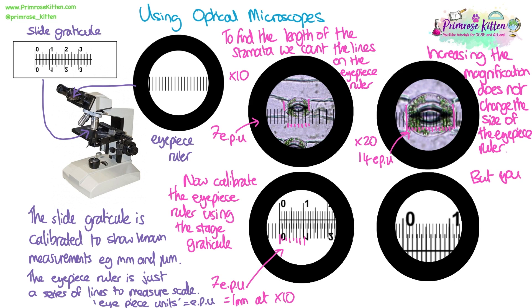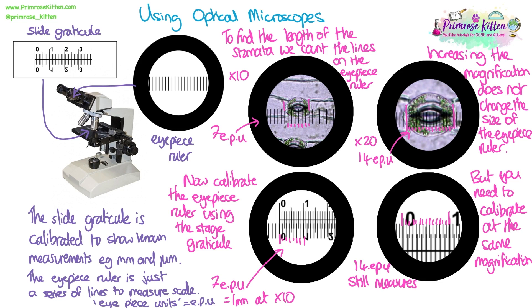When calibrating your eyepiece ruler, you must look at your slide graticule using the same objective lens you used to measure the sample. Using times 20 magnification, the slide graticule also appears double the size. So my 14 eyepiece units still line up with one millimetre — the stomata hasn't changed size at all. The key point is to use your eyepiece ruler to measure the length in eyepiece units, then calibrate it using the slide graticule at the same magnification.